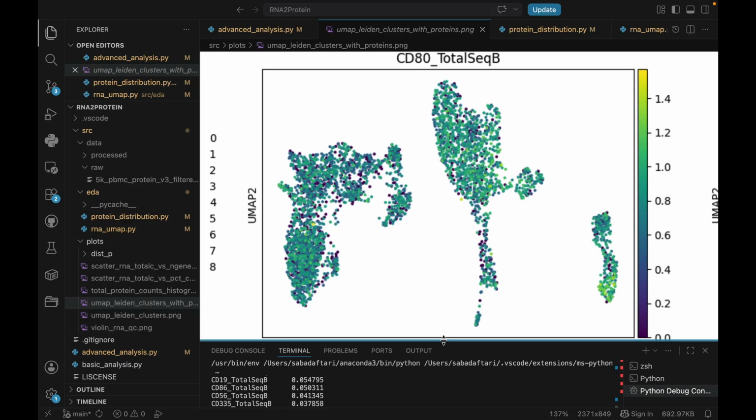Many cells have counts of 1, 2, 3, which are technically non-zero, but biologically meaningless. Their logged version, like log of 2 is 1.1, right? Still looks dark on the UMAP. This is why looking at both sparsity plots and UMAP together gives you a more complete picture.